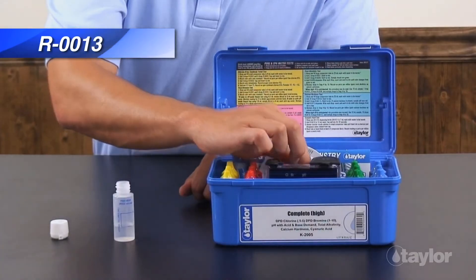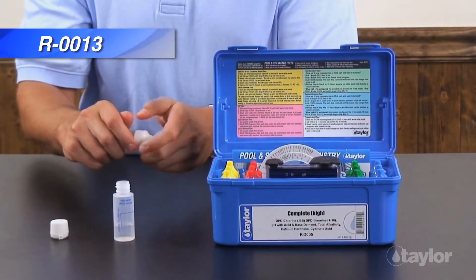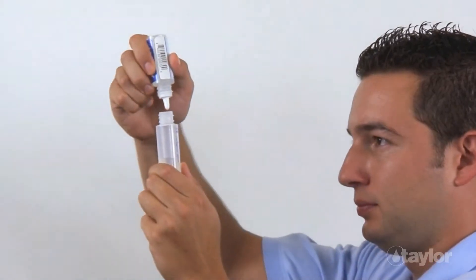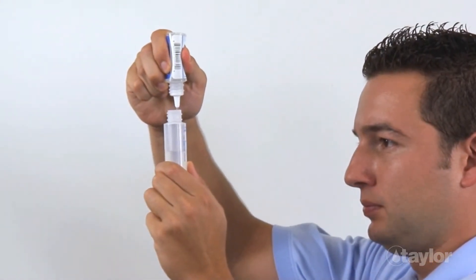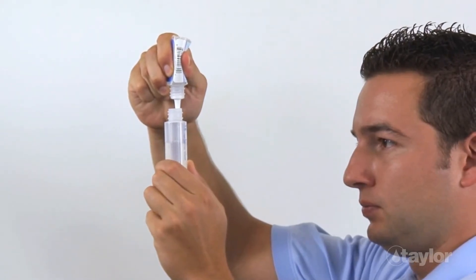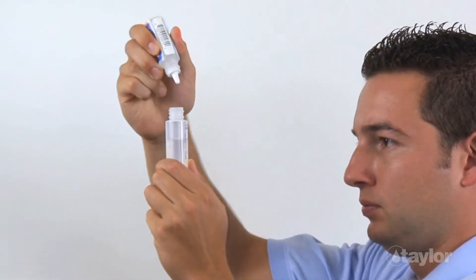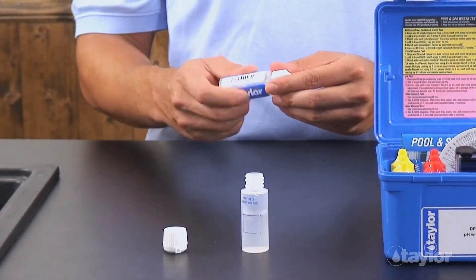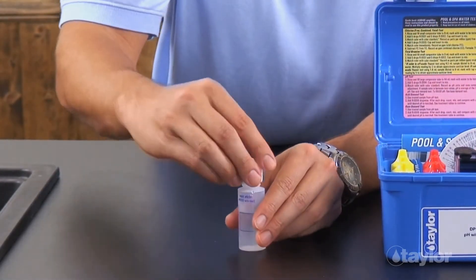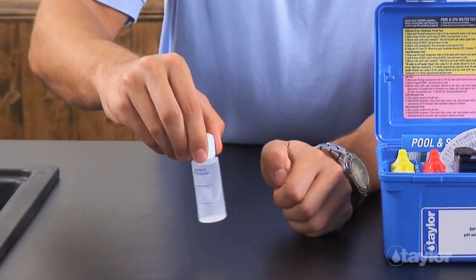Add reagent 13 to the 14 ml mark. Cap and mix for 30 seconds.